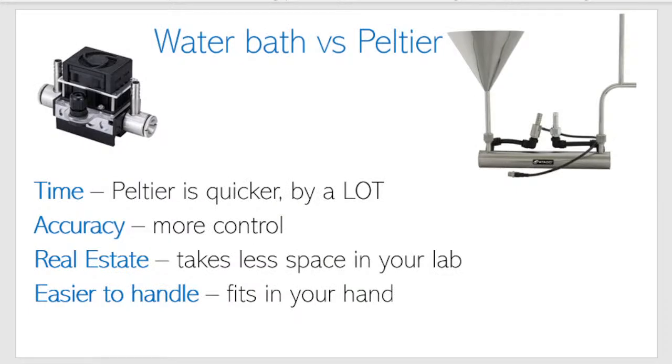The traditional way of controlling temperature would be through a flow tube or a water bath, which is what we see here to the right. Basically, you have a cell where you would inject or pour your sample, and the wall of the cell has a hollow wall or a chamber where water would be pumped in and around your sample to control the temperature.